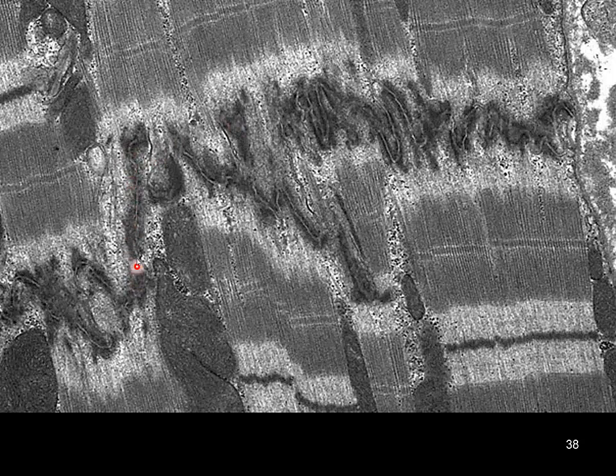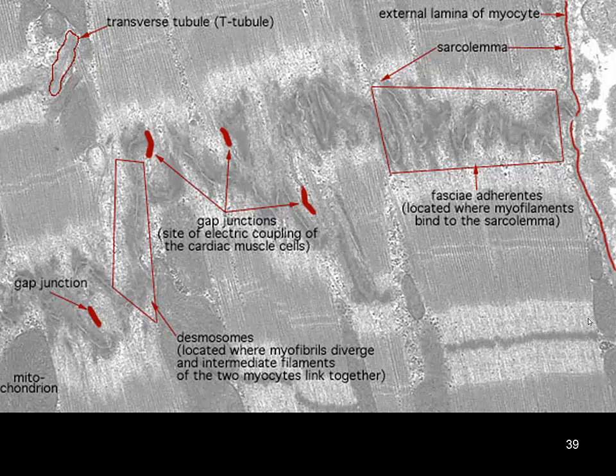Areas such as this, where we're running almost parallel to the sarcomeres, this is going to be where we will typically have gap junctions, versus where we have the transverse portion that is perpendicular to the forces of our contraction. That's where we're going to have desmosomes. But when it's all twisted and bent through here, it's difficult to really pick up the transverse versus the longitudinal portion that we draw out nice and regular in our textbooks.